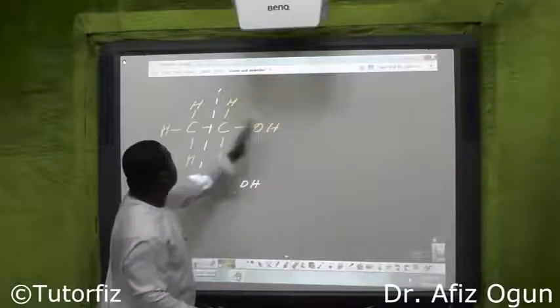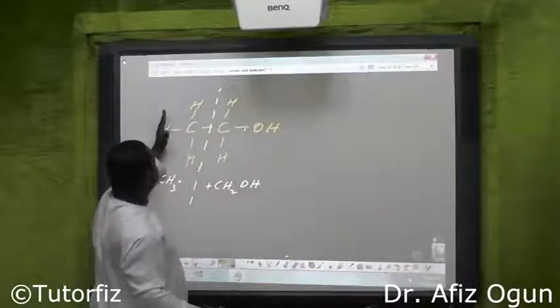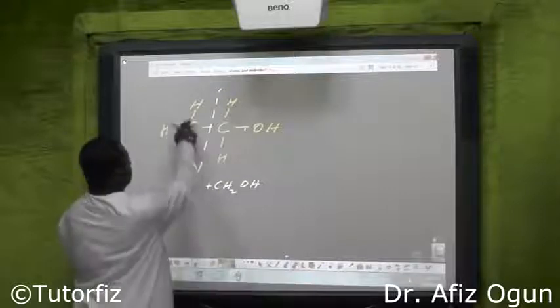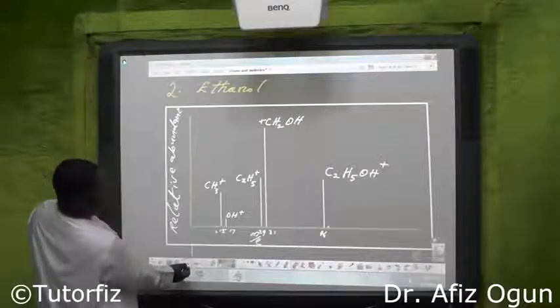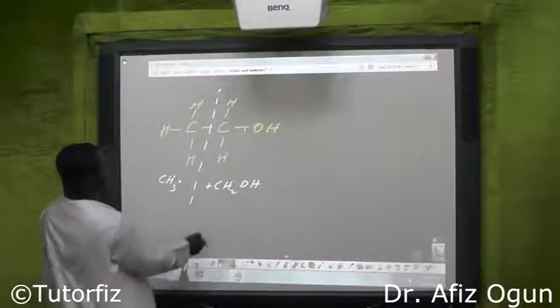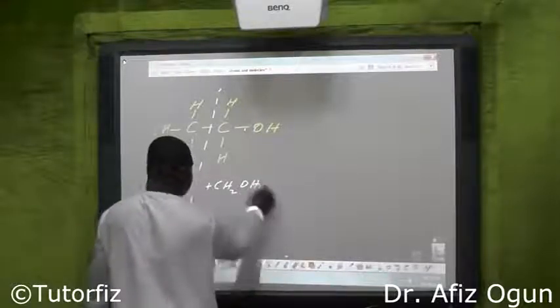OH peak, we got that. CH this, we got that. C2H5O, did we get that? Let's look at that. C2H5O, in case.